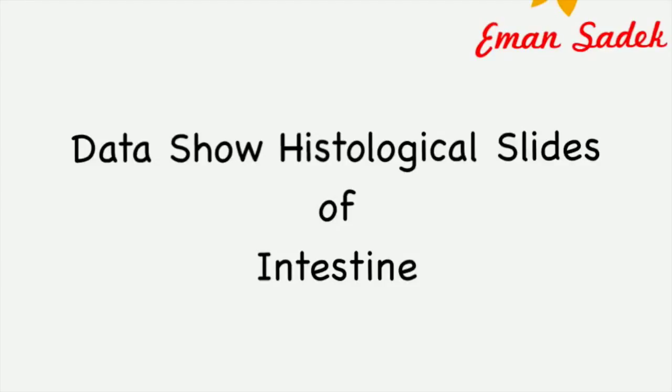Bismillah ar-Rahman ar-Rahim. This is the description of the data show histological slides of intestine.